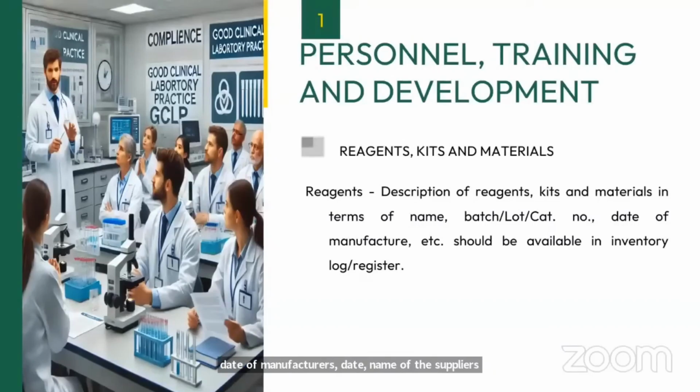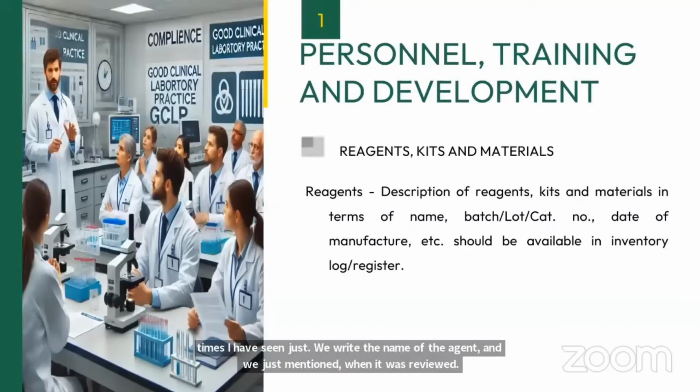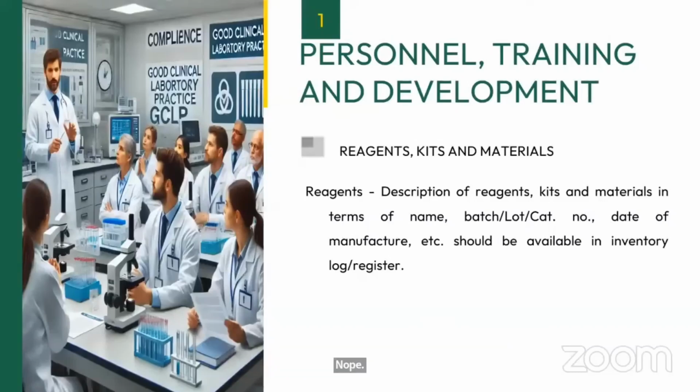So when we keep the record of the reagent, many times I have seen we just write the name of the reagent and mention when it was received. But apart from that, what is the purpose of that reagent? What is the material? What are the terms of that name? What is the batch number of that reagent? Lot number and catalog number should also be mentioned, and when it was manufactured and what is the expiry date of those reagents. It should all be included in your inventory log or register.